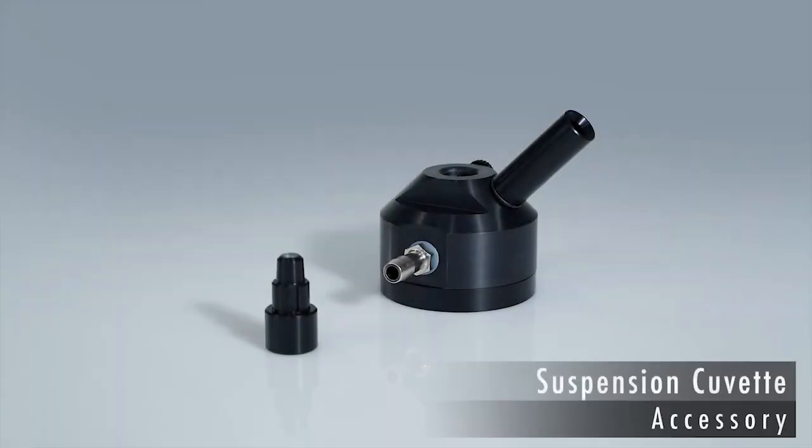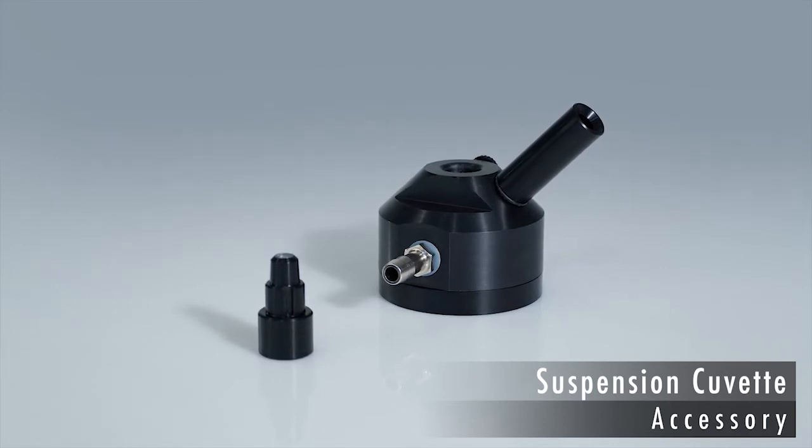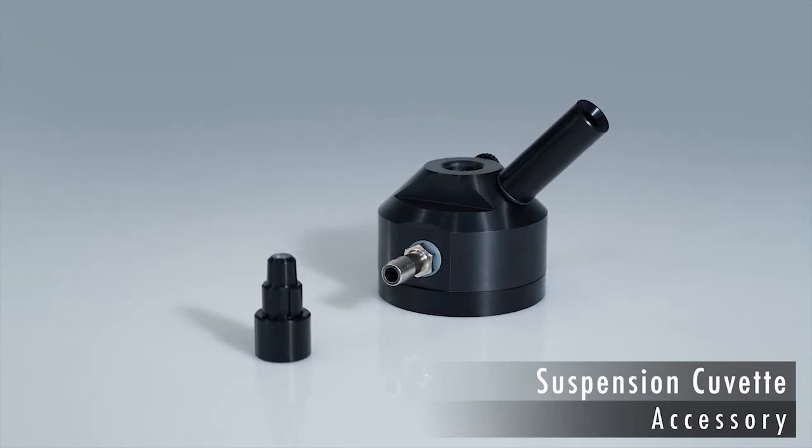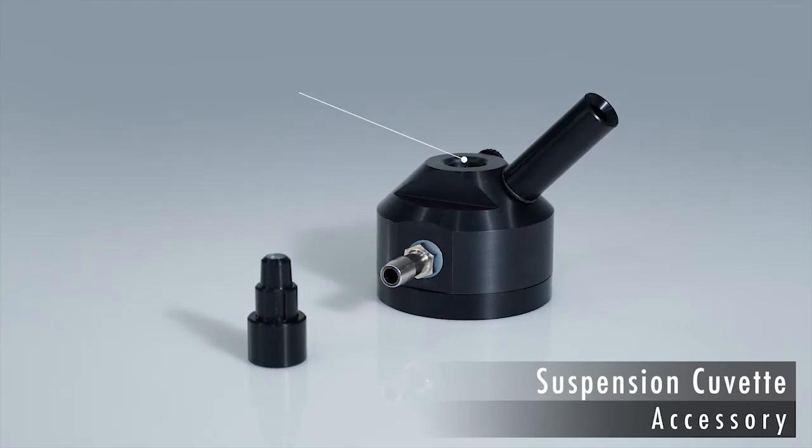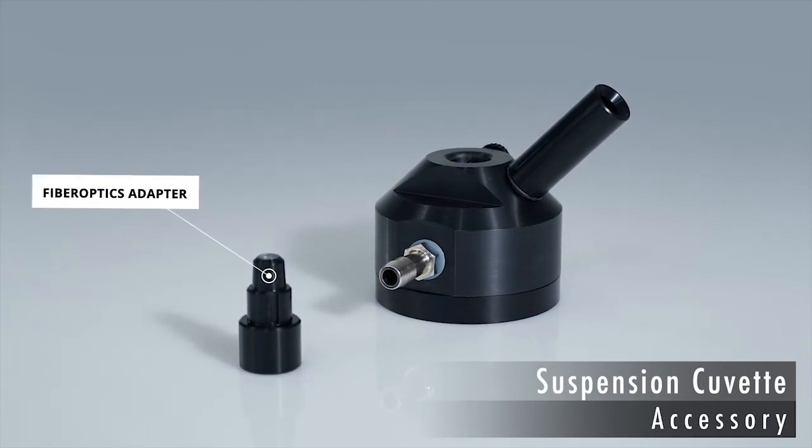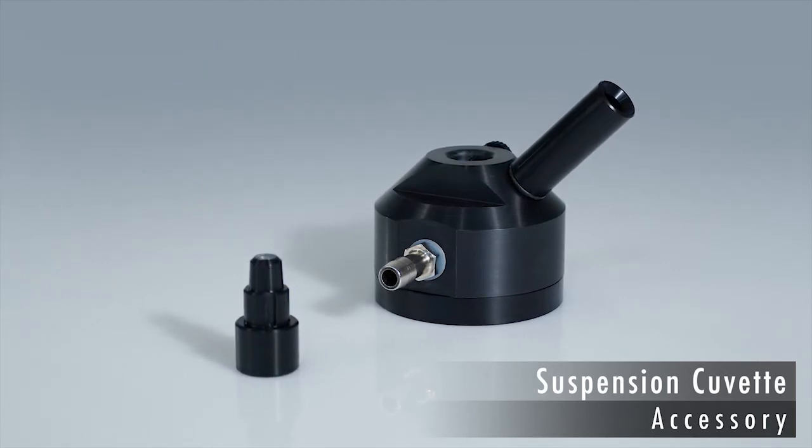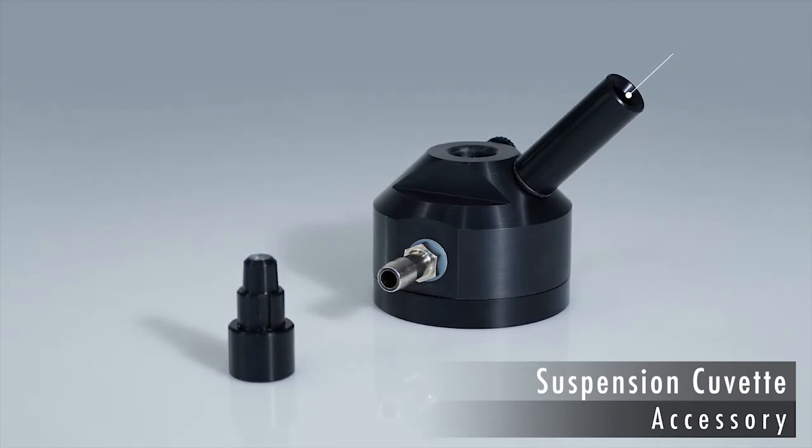The KS2500 Q-ET configures the mini-PAM 2 for investigating the suspensions of cells and isolated chloroplasts. The Q-ET has a central reaction chamber. An adapter fits the fiber optics at the top of the reaction chamber. The side port is tailored for adding chemicals with a microliter syringe.